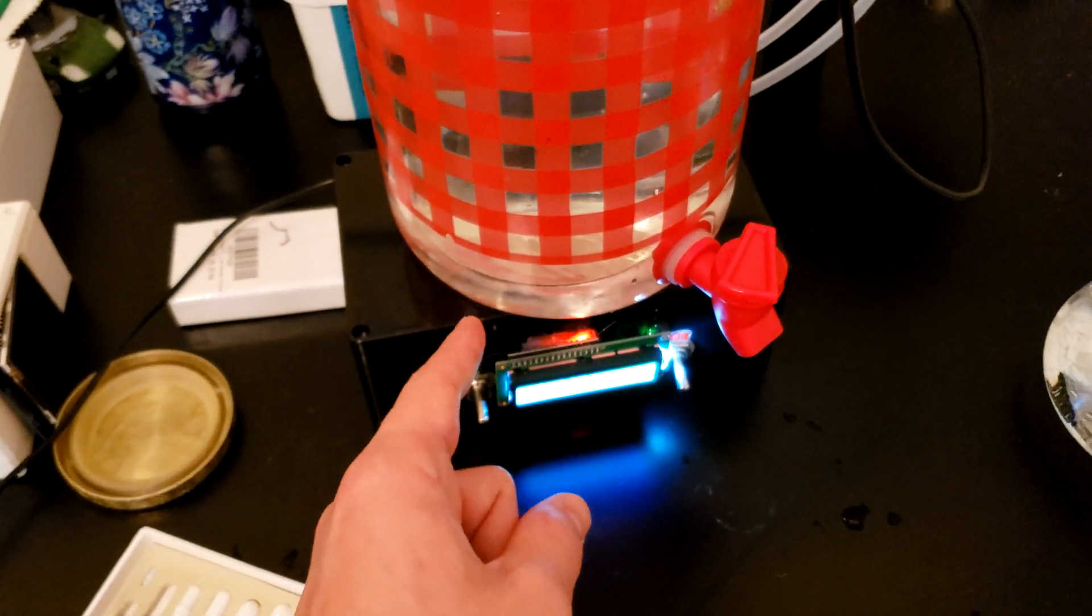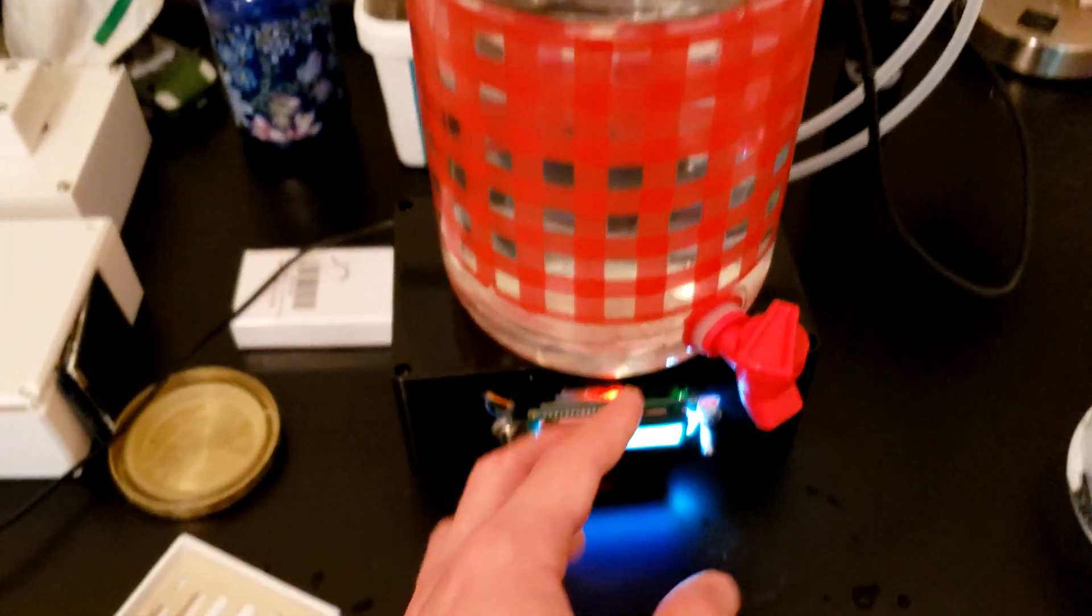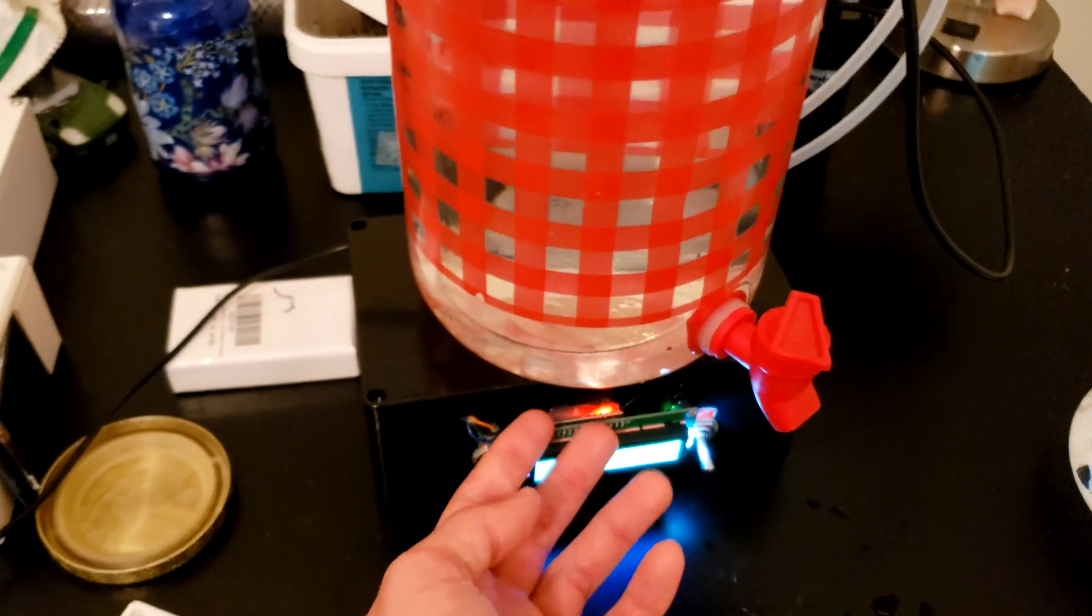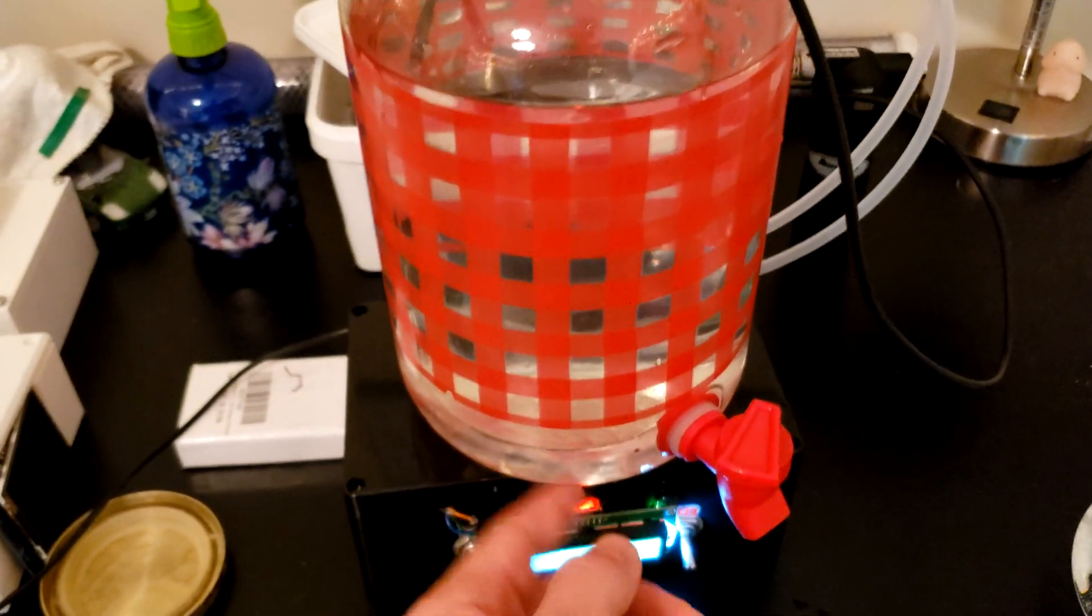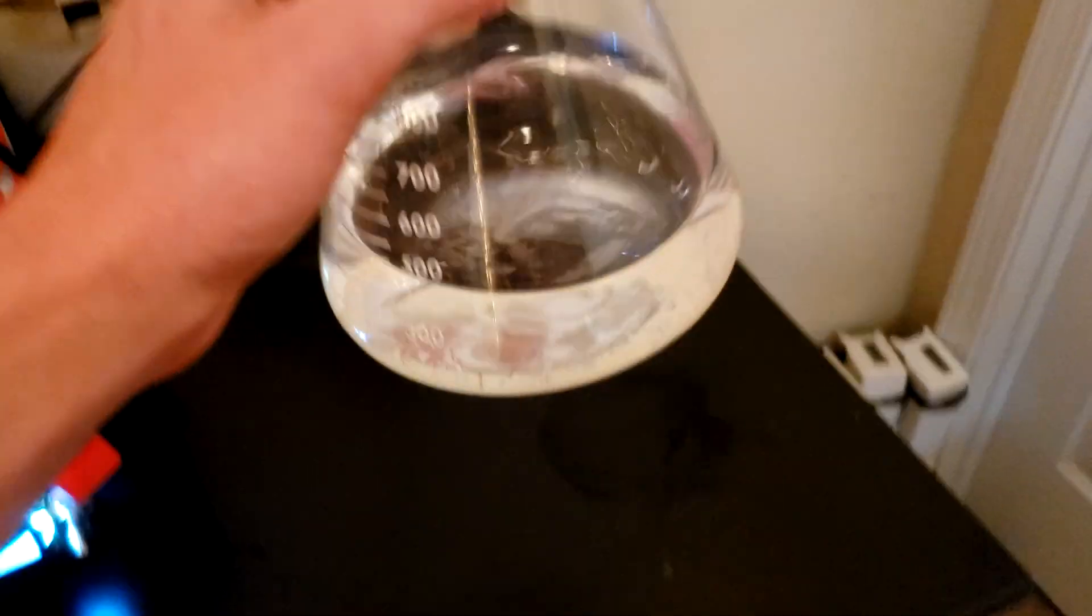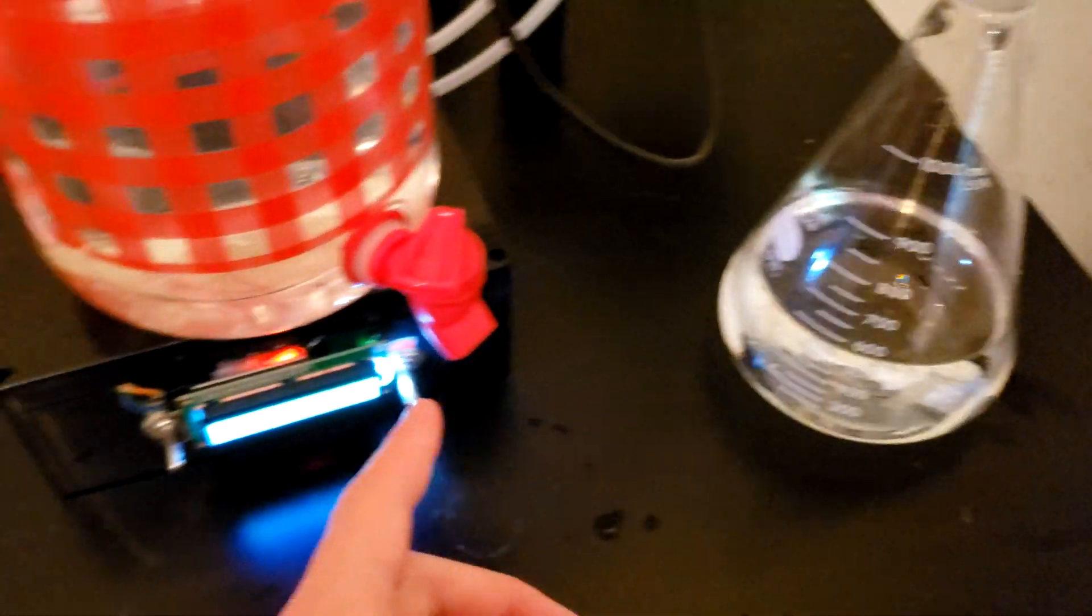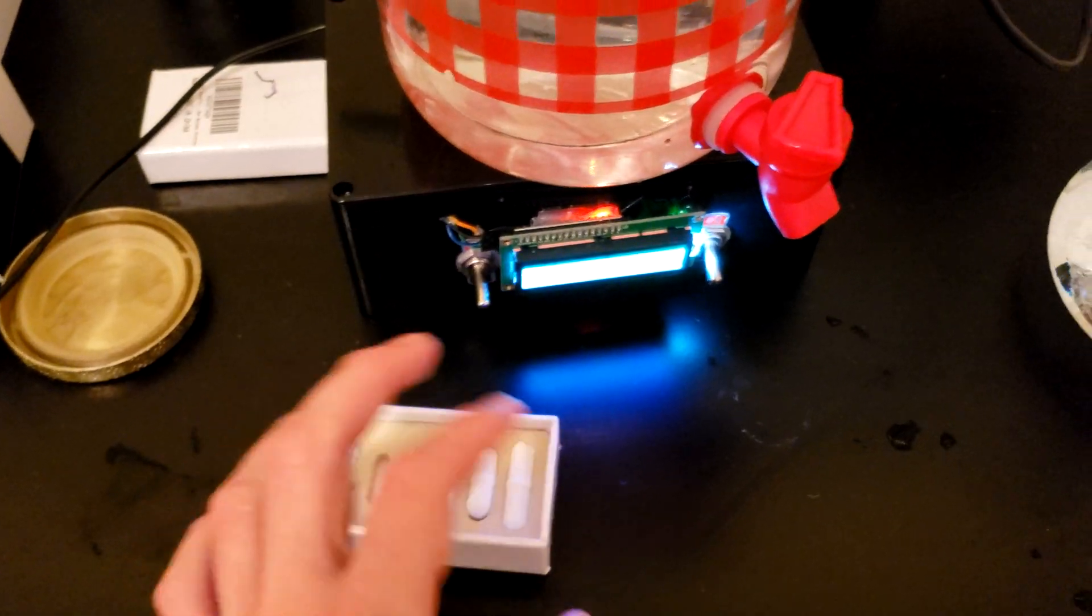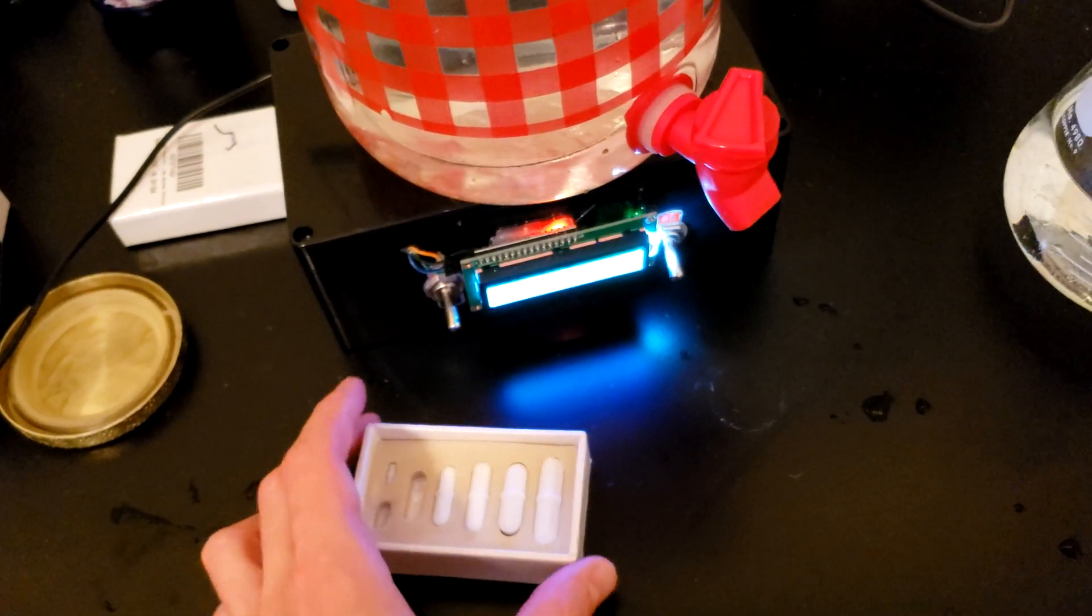After I added the voltage regulator to the motor for the stir plate, it was still spinning a little bit too fast. At first, I thought the issue was this container is a little bit concave, so the stir bar has to sit a little higher up. I tried my little flask here with the flat bottom, mostly flat bottom, and that worked a little bit better. I kept trying to use bigger and bigger stir bars thinking that the magnets would have more to hold onto if there was a bigger stir bar. It's the other way around.